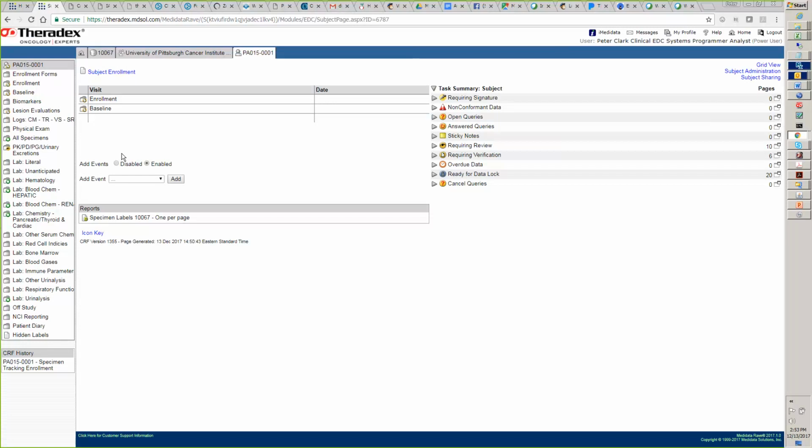And ideally, it's fairly real time. When you receive the specimen, the day that you receive it, it's great if you could log it into RAVE. I understand, of course, that that's not always possible, but that's a good intention to work towards. Yeah, that definitely will not be happening this next week. But normally that is how I roll. So I will check my emails once a day, but that's as far as I'm going to go.